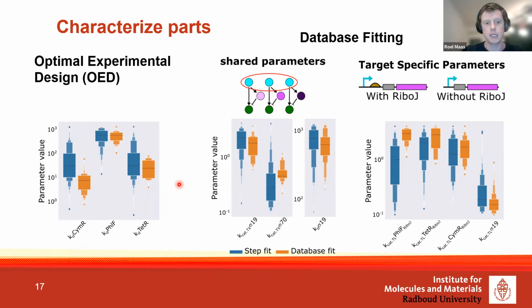And the system responsiveness at the end is very much determined by how quickly the system reacts to changes in the repressor concentration. So by continuously changing this, it's better to estimate the parameters using this approach.